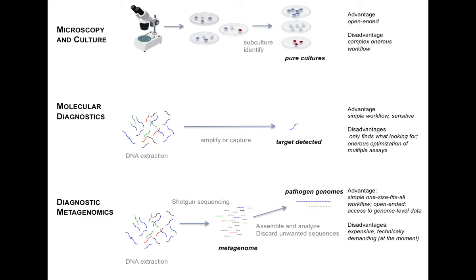But the interesting thing is that we may then be able to get the pathogen genomes from that metagenome. And this may be a very simple way of doing things. So the advantage is it's very easy. You just go and extract the DNA and you sequence it. There's none of this business, oh, I've got to grow this organism in CO2, this one anaerobically. I've got to put that organism on a special selective medium or whatever. You could just do the whole thing through sequencing.